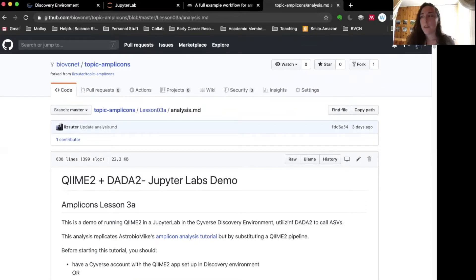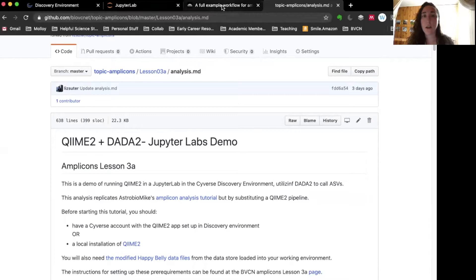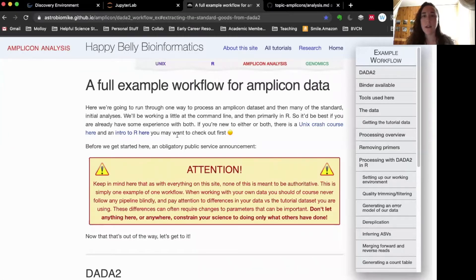If you're following along, hopefully you have done the pre-requirements for this lesson, which are to have either an installation of QIIME 2 or to have a CyVerse account and be able to set up the QIIME 2 instance or the QIIME 2 app in the discovery environment. If you have trouble with that, there's a separate lesson and associated video to help with that.